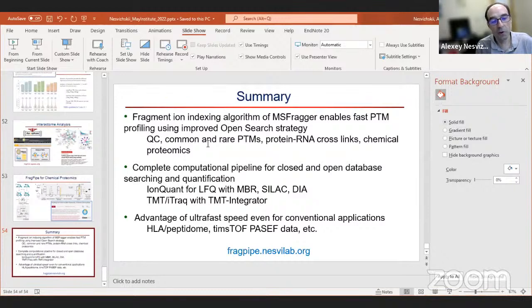In MS3, you take one additional step of actually quantifying from MS3, where you select the expected Y and B ions from the peptide on which you're acquiring the spectrum, and collect an MS3 spectrum on that peptide. The reporter ions in MS3 then will really reflect just the peptide that you identified. I mean, that's also not perfect. There is also some interference, but by this additional isolation step, you're removing some of these interferences from quantification.